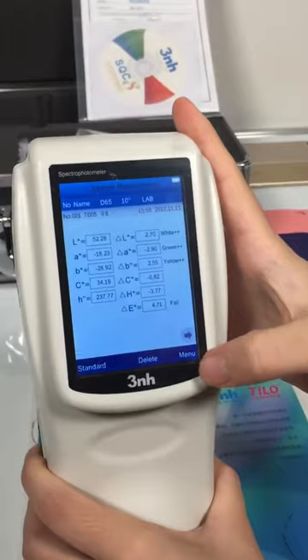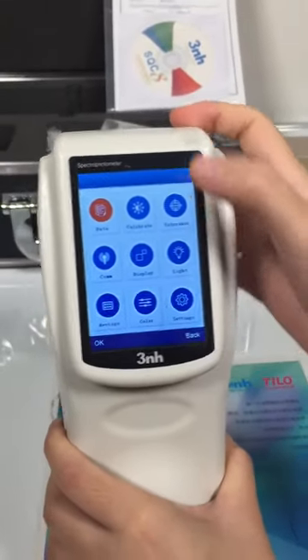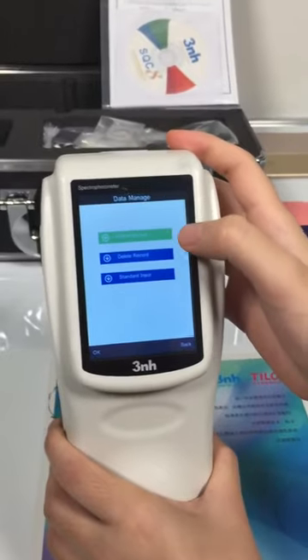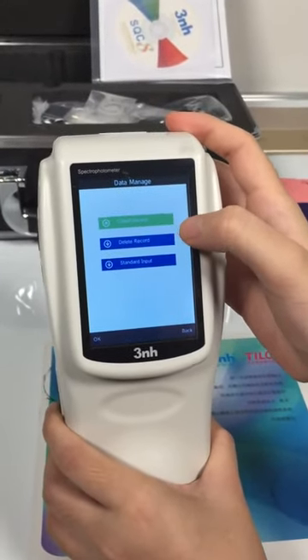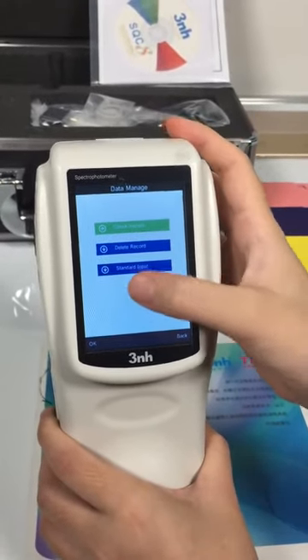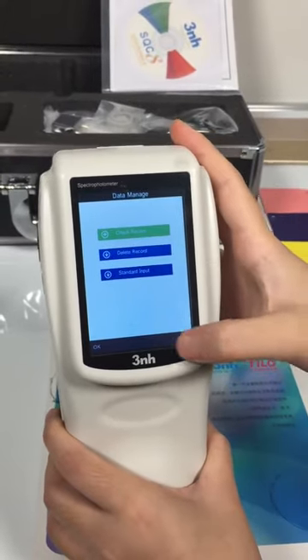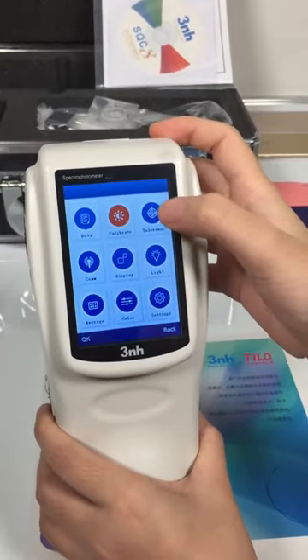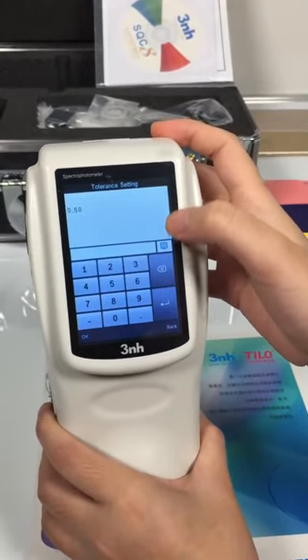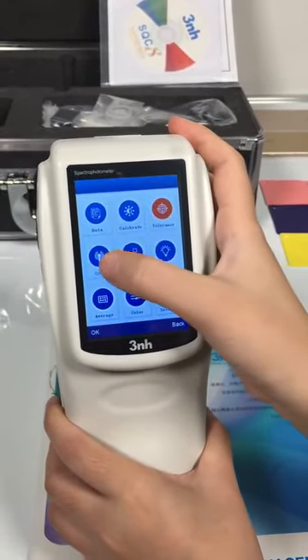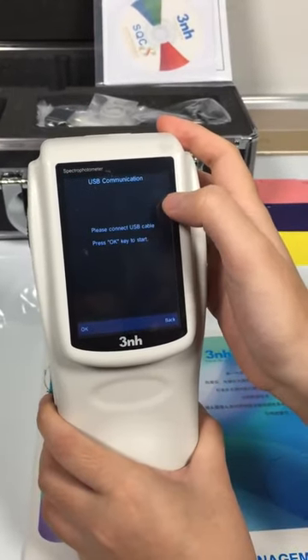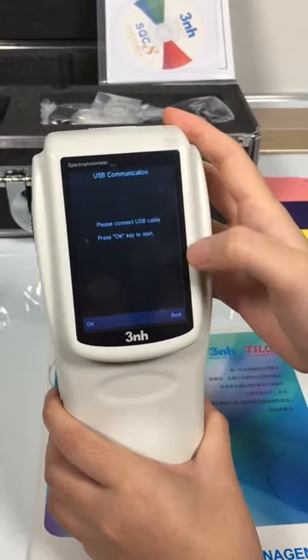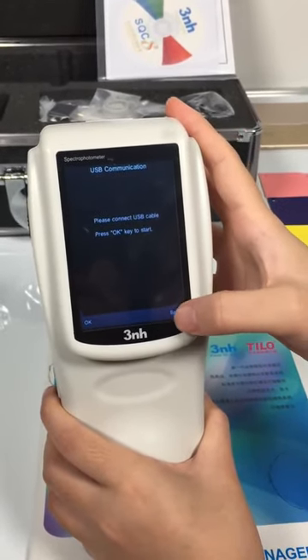We can enter the menu of the machine. First, the data — we can see there are check record, delete record, and standard input. The next one is calibrate. Then the tolerance setting. Communication — this is for connecting the machine with your computer.